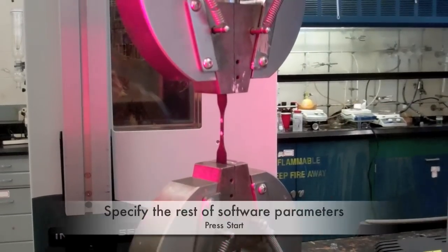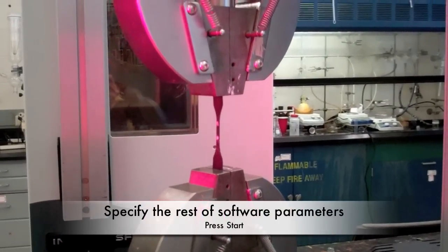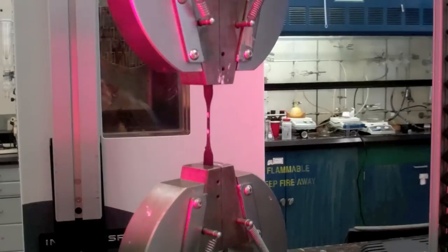Go back to the method tab to specify the other parameters of your test and then go to the test tab. Click the start button to begin your test.